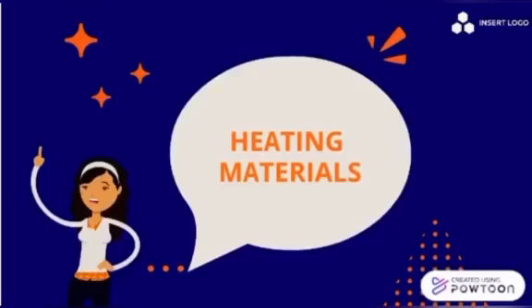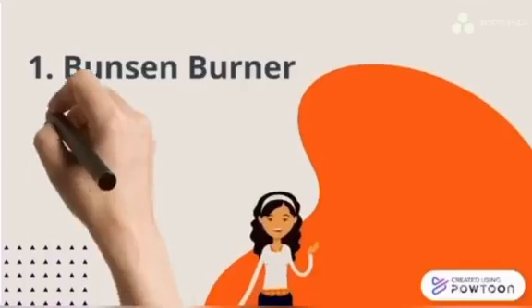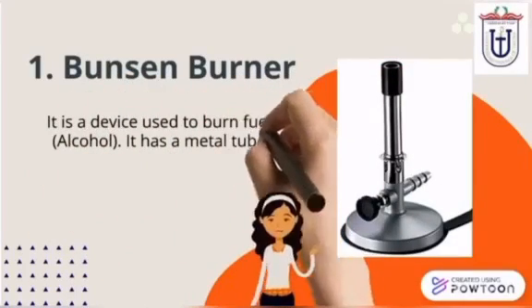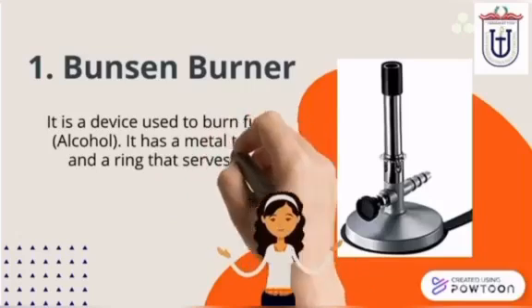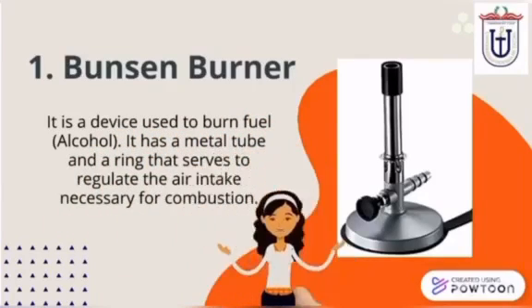Now we are going to see the heating materials. 1. Bunsen burner. It's a device used to burn fuel, alcohol. It has a metal tube and a ring that serves to regulate the air intake necessary for combustion.